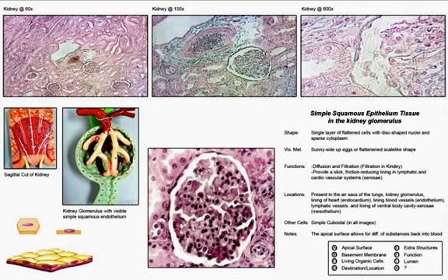This would be deeper into the medullary region right here. We can see a nice blood vessel, and that blood vessel would contain a number of blood cells surrounding it, areolar connective tissue, and that would be binding the tissue we've previously described with the glomeruli and the cuboidal lined tubules surrounding it. This vessel would be located in the kidney as in this part as one of these larger blood vessels leading into the area where the glomeruli are found at this interface. This is the cortical medullary interface between those two portions.